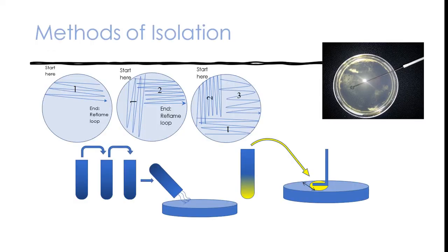If you look here at this diagram, the first row with the 3 plates is the streak plate. Streak plates can be done in either 3 or 4 sectors. You grab a bacterium from your growth plate and you streak it in one area. You turn your plate and then streak it again, and do it 2-3 times to give you a total of 3 or 4 sectors. Each time you're doing this, you're diluting the sample.